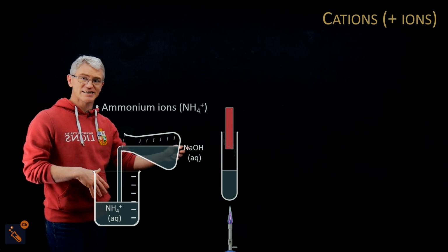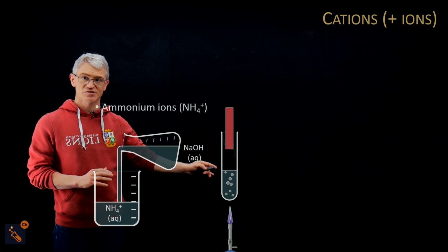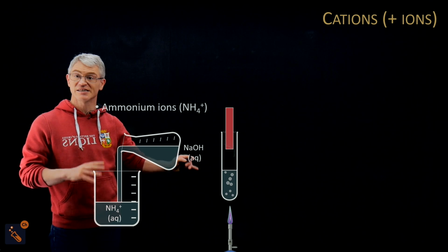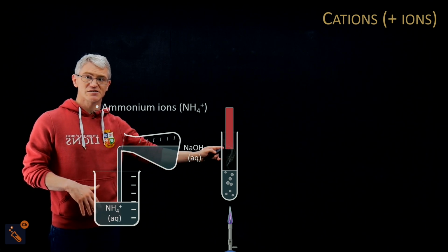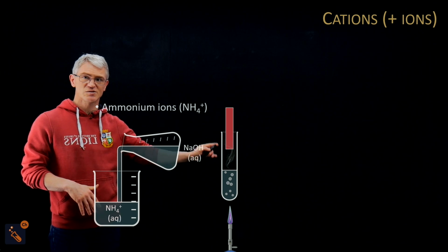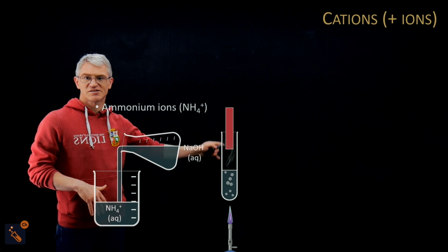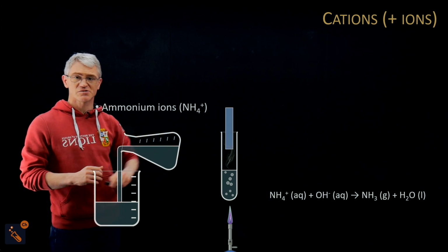Then we heat it gently, and you start to get bubbles, as you can see here. As you're starting to heat it, you have to do it really gently, otherwise it bubbles up and starts to produce steam. Can you see this steamy, wispy vapor here? That then reacts with this red litmus paper, and it turns that red litmus blue.